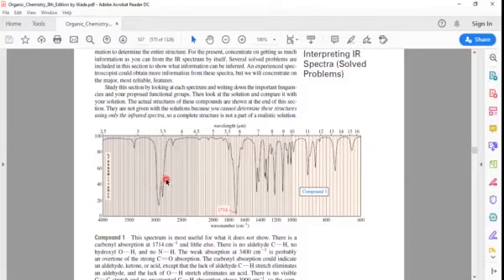And on the left you have no peak, but on the right you have a peak. So this is the aliphatic region, and what we have is a carbonyl compound. This is an important region for an aldehyde or ketone, but we do not have those peaks which are characteristic of an aldehyde. So most probably we can say this is a ketone, maybe, but may not be. Other data is required so that we are able to determine its structure.